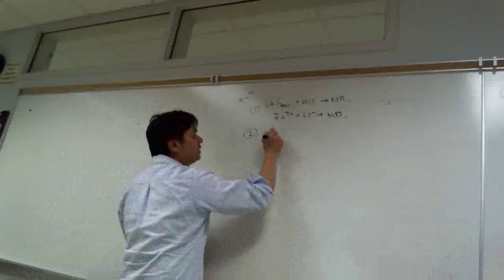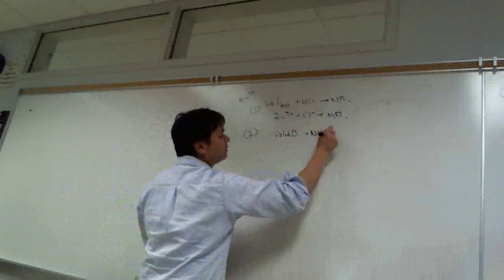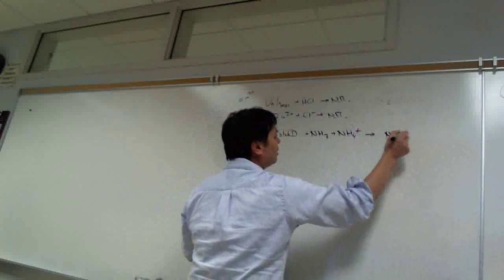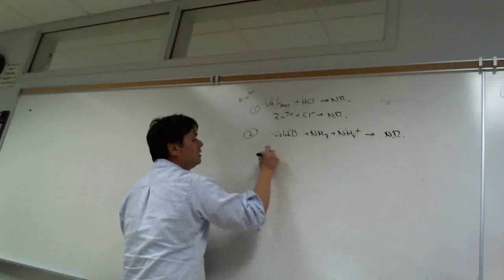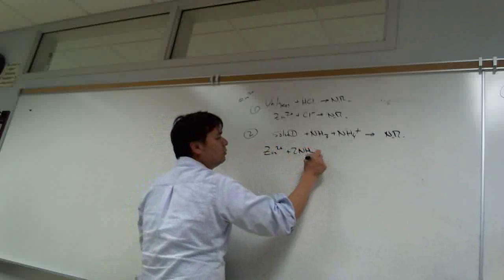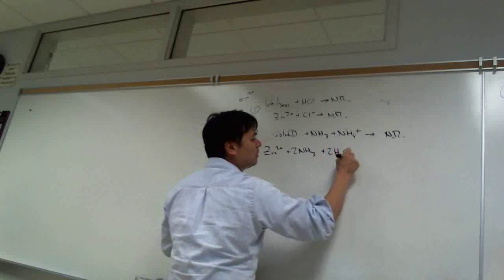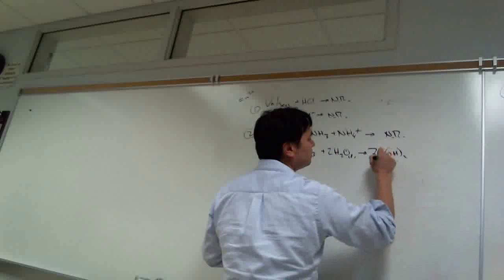Now we're going to take our solution from 1 and add ammonium to this, to C. But we end up with NR here. Although we expect a reaction because zinc 2+ should precipitate with ammonia and ammonium to form zinc hydroxide. This reaction should have happened, but it didn't.